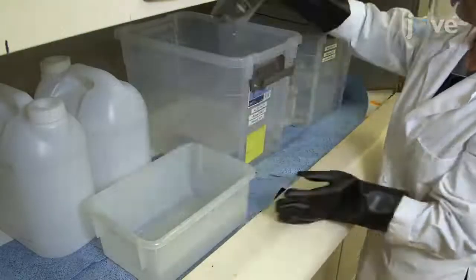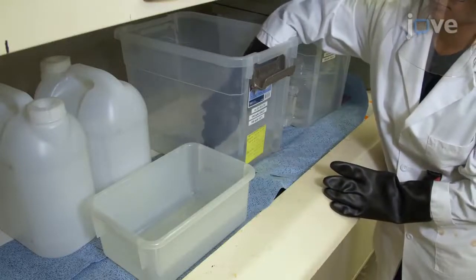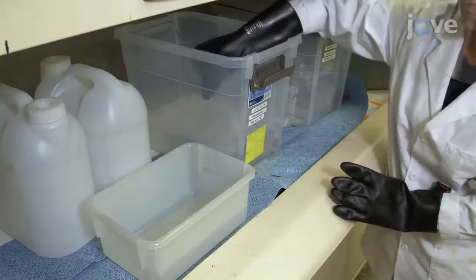To begin, acid wash all glassware in 100 millimolar hydrochloric acid and 100 millimolar nitric acid for a minimum of two hours prior to utilization in the CAS assay.